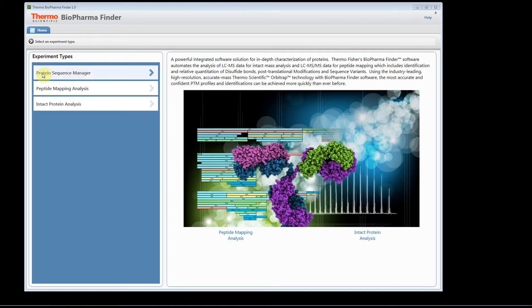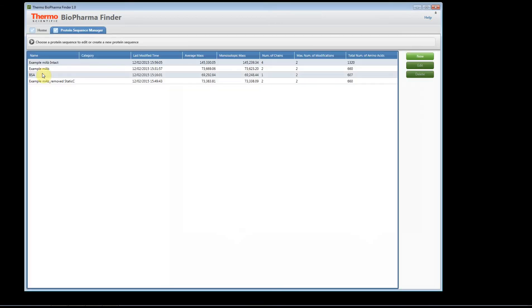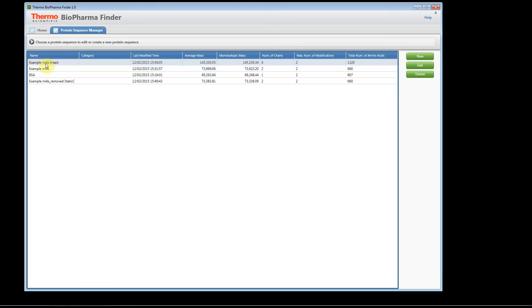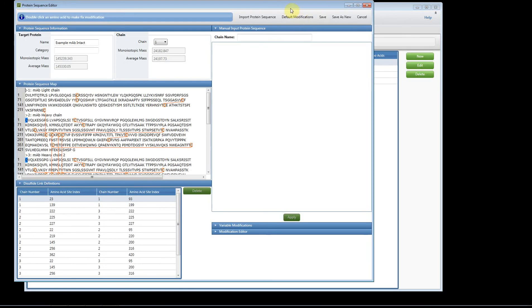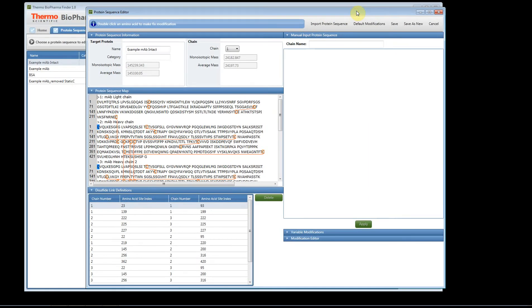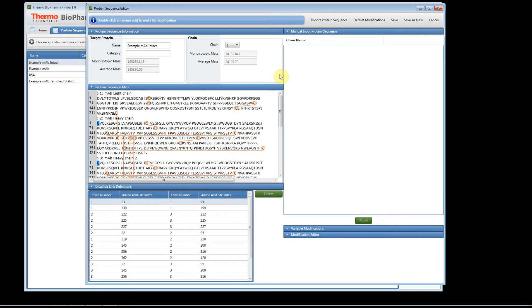First, we're going to begin by adding our protein sequence, so click on the protein sequence manager. I've already added the protein sequence, but I'm going to show you what I did. I'll click on the example MAb Intact and click Edit. The data file I have is an intact antibody analysis, so the molecule is a 145,000 Dalton protein. We need to make sure we bring in the correct protein sequence.